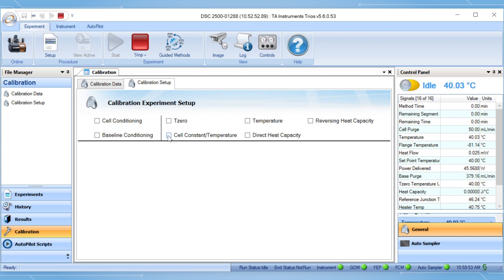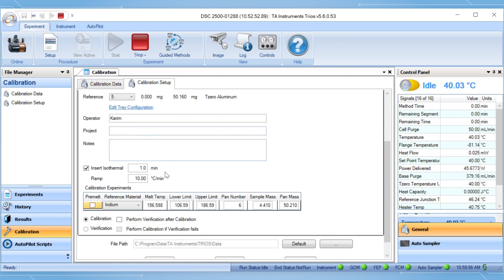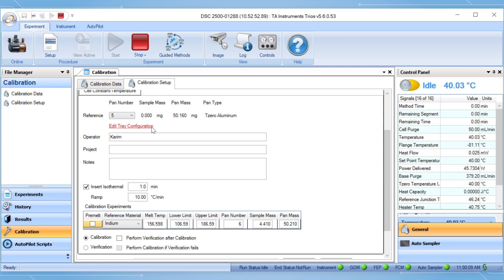Check the box beside the cell constant and temperature calibration. Then you will be able to input calibration parameters and information such as ramp rate, operator, and any additional notes. For instruments with auto sampler, you can add the information of the reference pan in edit tray configuration.